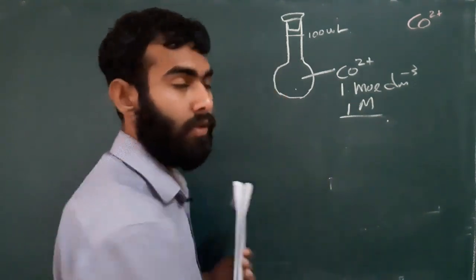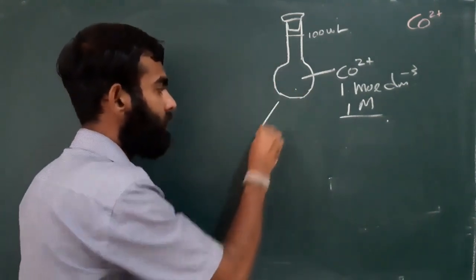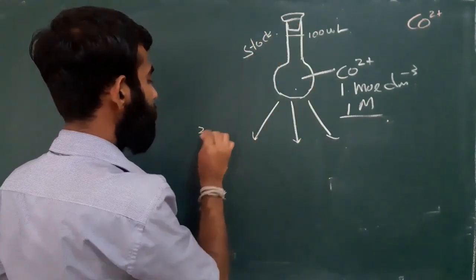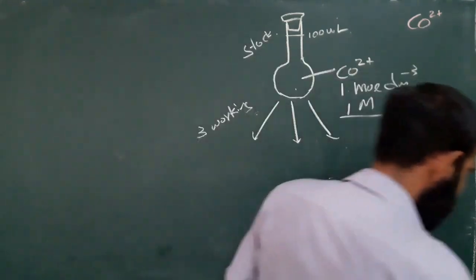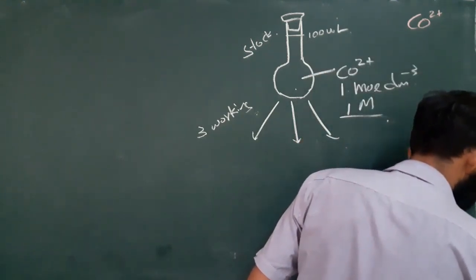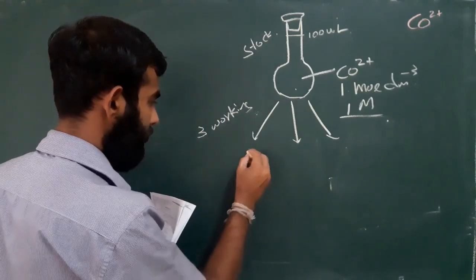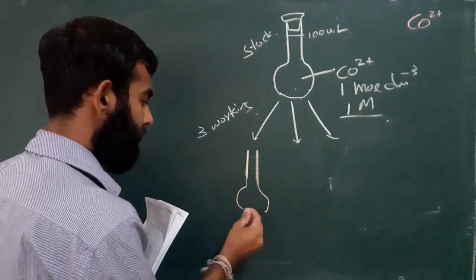By using this stock solution, we will prepare a dilution series. First of all, we have to make 3 working solutions, or dilutions. What are they? The concentrations may differ in your book.